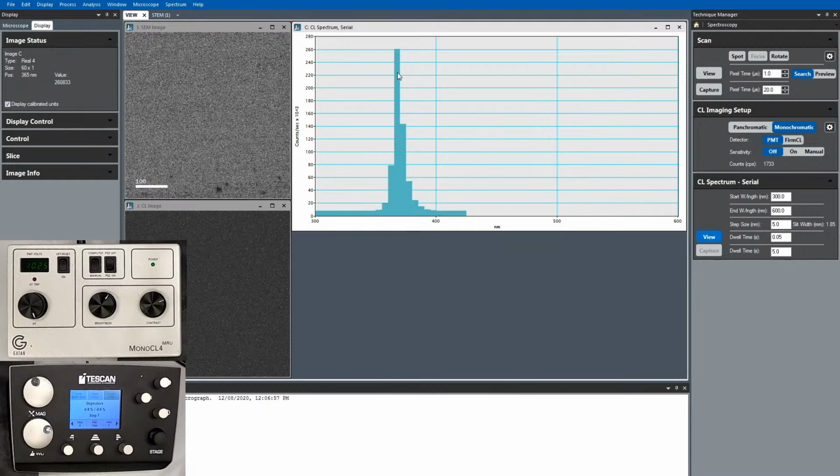If you want to do infrared measurement, you do have to let us know, because we have to change diffraction grating, and there's a different preamp to use. We have to use liquid nitrogen to cool the photomultiplier, etc. So the bulk of CL that we've ever done in the lab is not infrared. So it's just kind of in the short UV up to the near infrared.